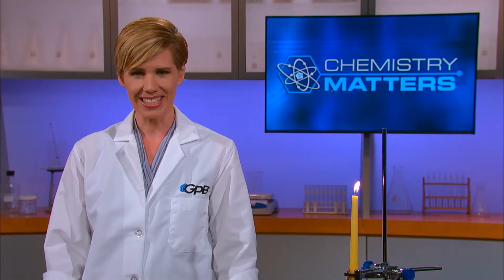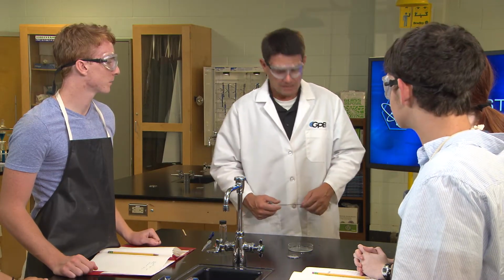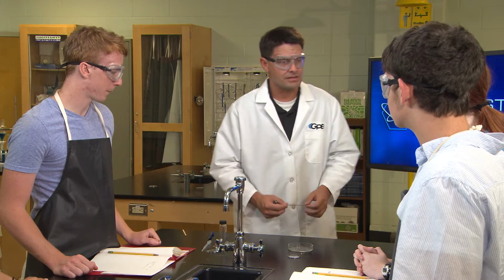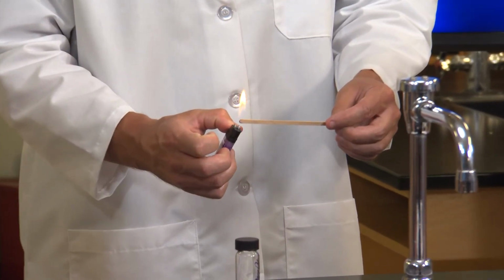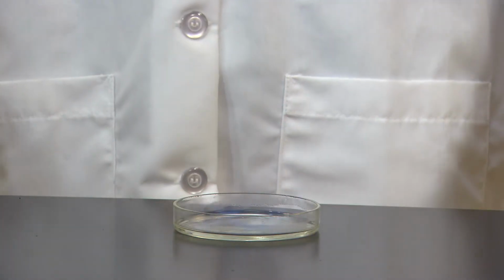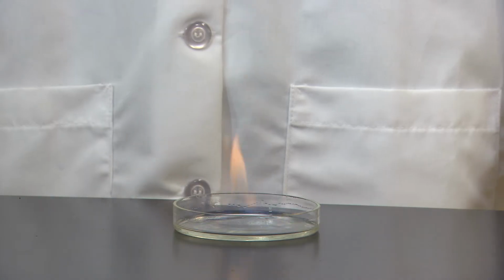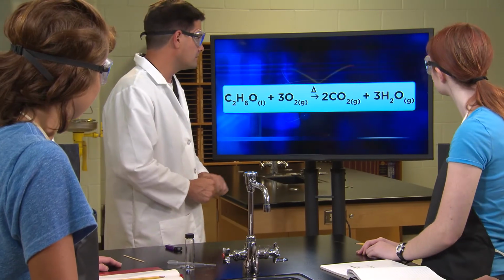So with that in mind, let's head back out to our classroom. Combustion reactions give off energy in the form of heat or light or both. And I've already put some ethyl alcohol in this Petri dish. So let's see what happens when I light it. Now while that's burning, let's take a look at the reaction here on the monitor.